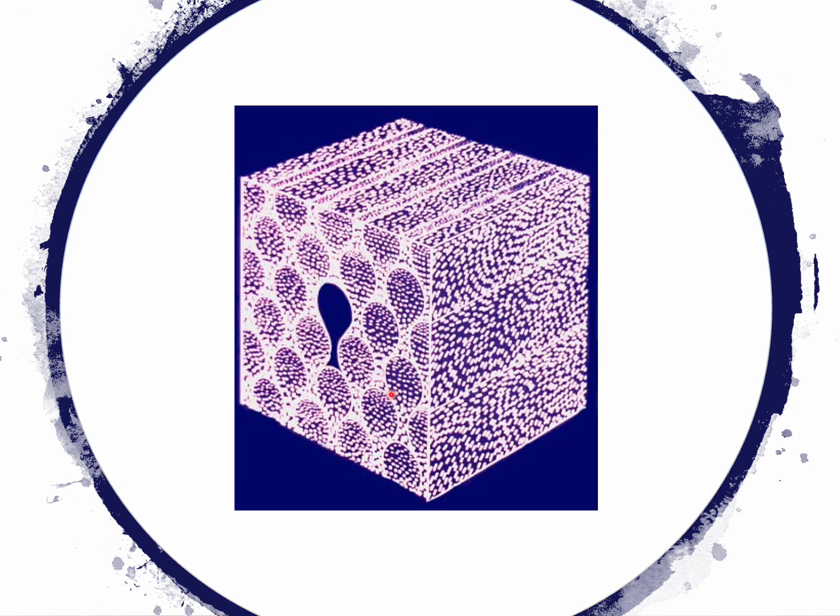So anyway, this keyhole shape has a head and a tail. And as you can see, each tail has two heads beside it. And it's composed of these millions of crystals stacked over each other.